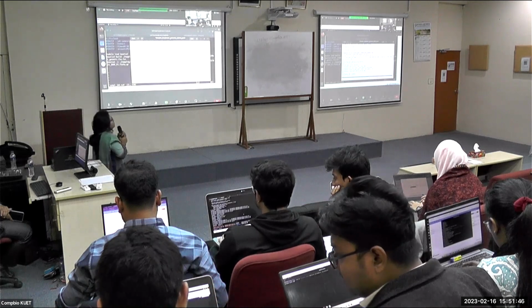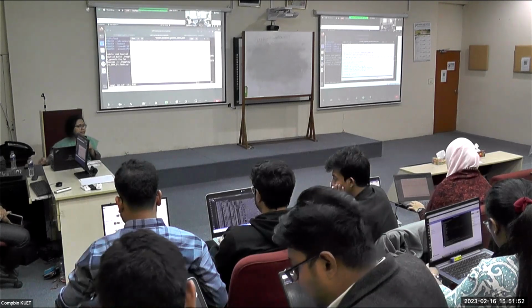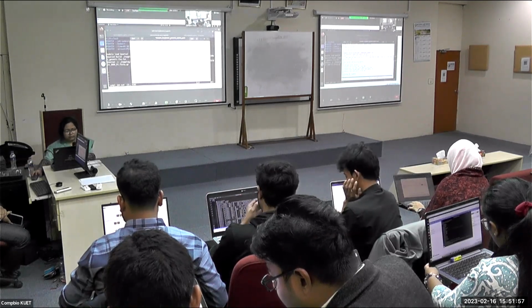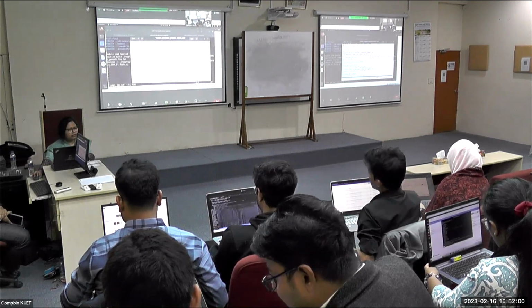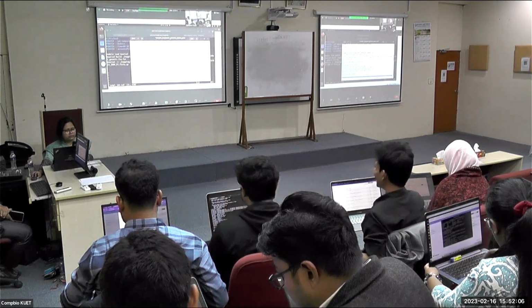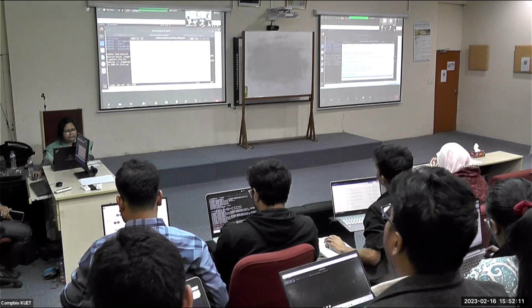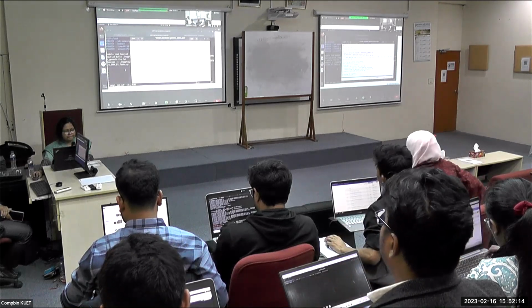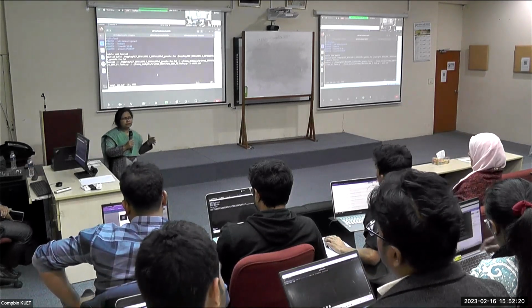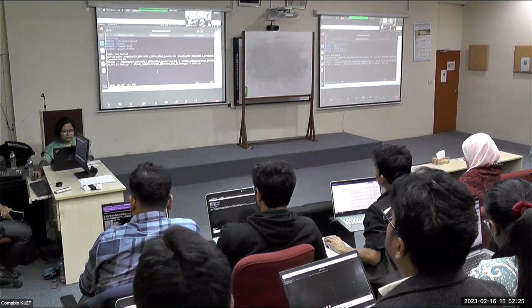So if you are interested, you can just try on your own the sorting and the indexing commands, but we will not go into that now. But in this batch file, after these lines, you can put the previous commands as we tried in our computer: the sorting and the SAMtools view, the SAMtools indexing, these commands. But don't try the IGV in HPC because it will not show you the graphical interface.